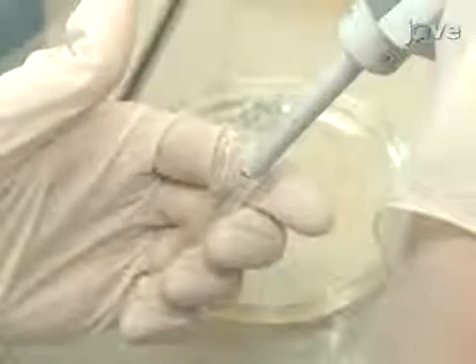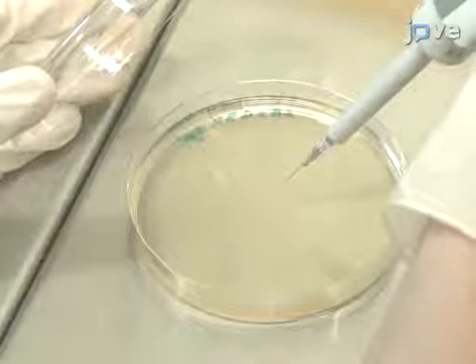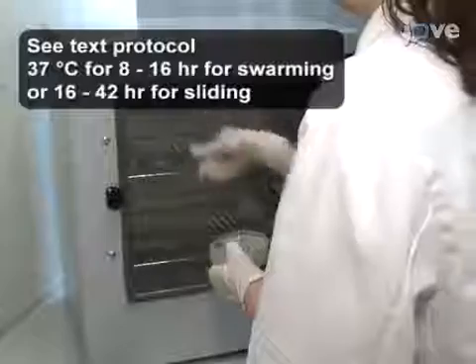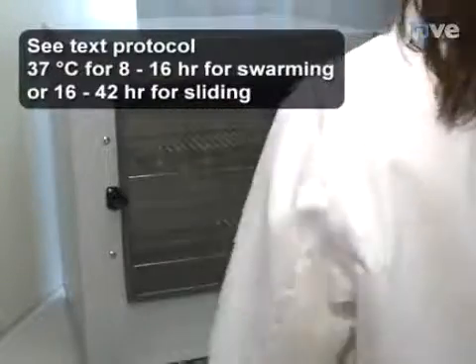Using a micropipette, spot 2 microliters of the mixed culture onto the center of a pre-dried 90 millimeter LB agar plate in the laminar flow hood. Place the plate to dry for 10 minutes. Finally, incubate the plates at 37 degrees Celsius in an upright position to prevent condensation from collecting on the agar surface.